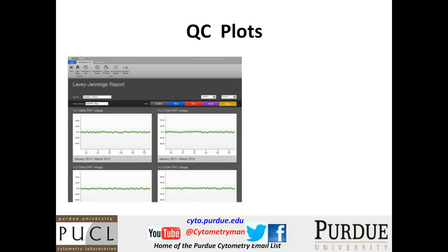Now, in talking about the laser and the laser quality and the signal quality, it's something that people have talked about for years and years, and I think is now becoming more common in instrument design, that you get the Levey-Jennings plots for every one of your detectors, and the Attune is no different.